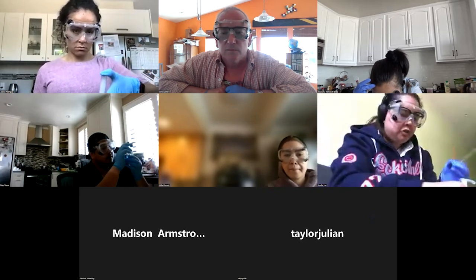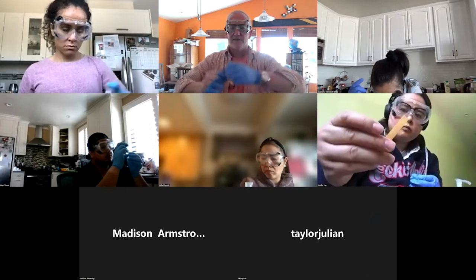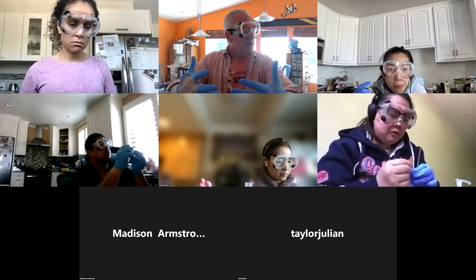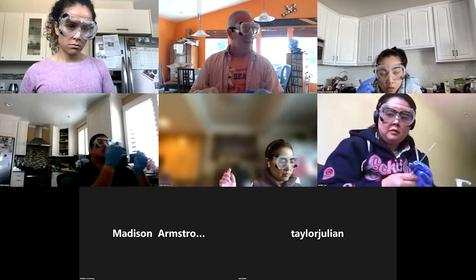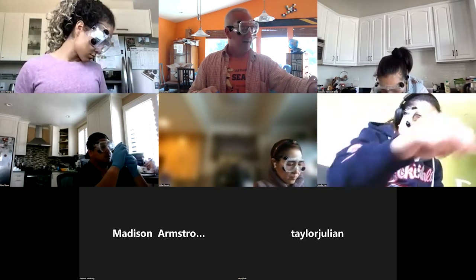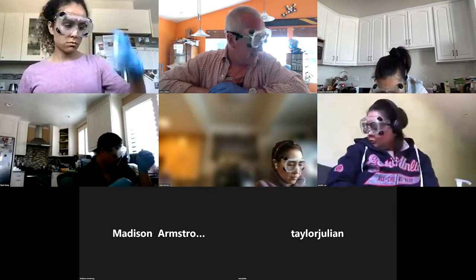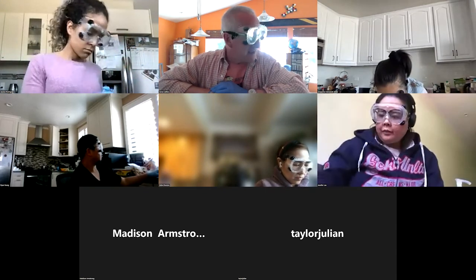There's not much change to my paper. Yeah, that's to be expected, because I think most commercial soaps, they don't want people to burn their hands, right? So generally they're going to make sure that the pH is almost neutral. So it should be pretty much the same color. Yeah, mine was like pH 6.5. I was actually surprised with how low that was.